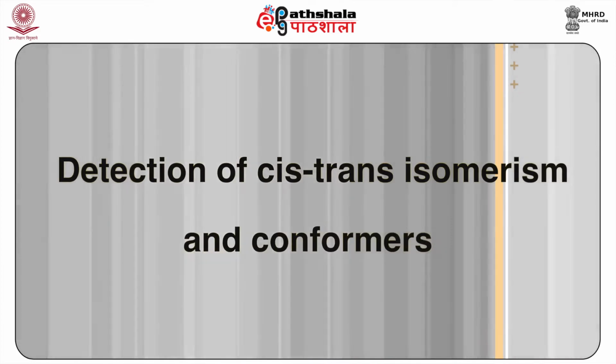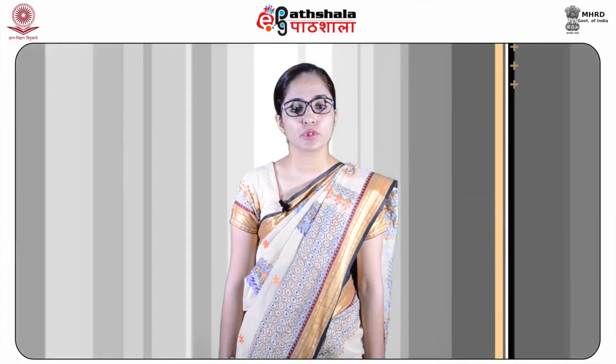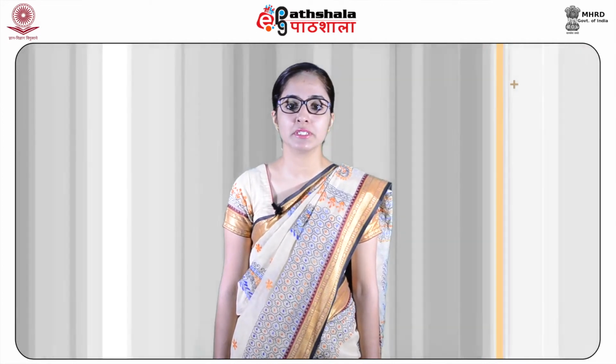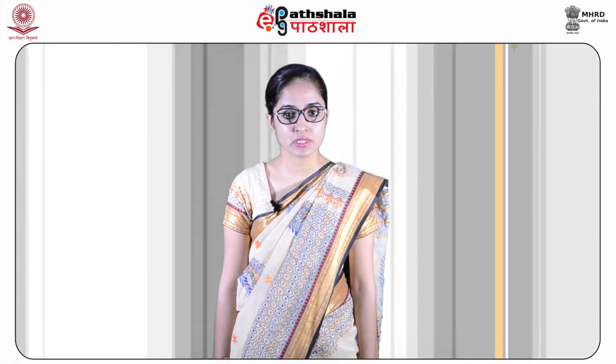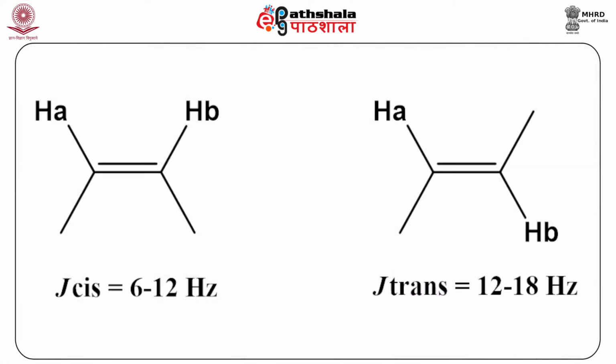Now, the third application is the detection of cis-trans isomerism and conformers. Proton NMR spectroscopy can be easily helpful in distinguishing between cis and trans isomers because the concerned protons have different values of chemical shifts as well as coupling constants. For isomeric olefins, J trans, that is the coupling constant for trans protons, is always greater than the coupling constant for the cis protons. Thus, it is possible to determine the configuration of geometrical isomers of a disubstituted olefin easily through proton NMR spectroscopy.